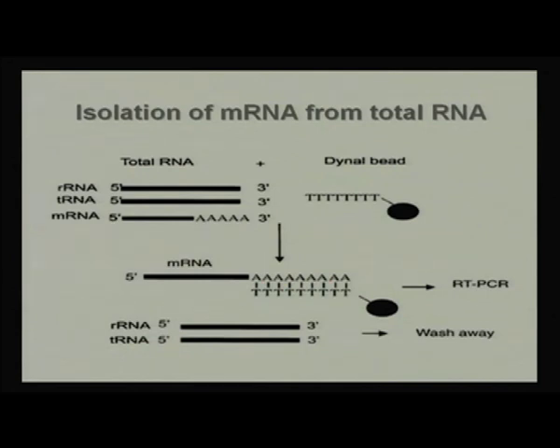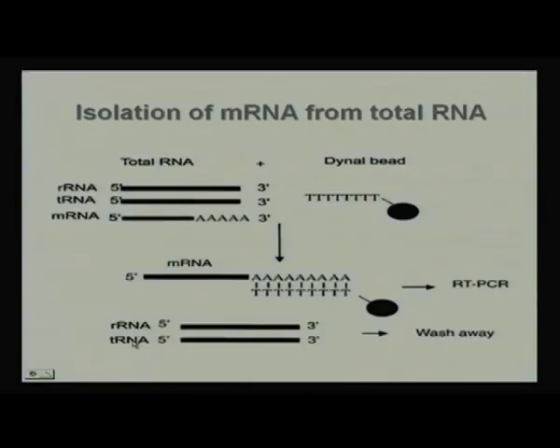The beauty is that when we go for mRNA isolation from a mixture of mRNA, tRNA and rRNA, we know that mRNA has a poly-A tail, and if we use the oligo-dT tail, then A to T binding will occur, and mRNA gets separated. The tRNA and rRNA mixture, you simply pass through a GFC column. Based on size, we can separate both molecules out of this column.